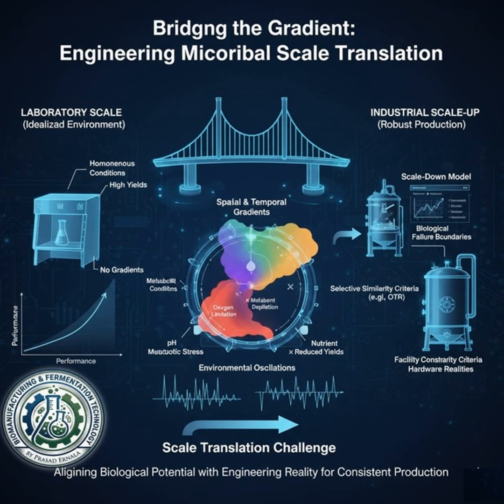So if these failures are so insidious, what are the warning signs? What are the diagnostic signatures you can spot before the batch collapses? These are so critical because they help you tell the difference between an engineering problem, like a gradient, and a simple biological problem.